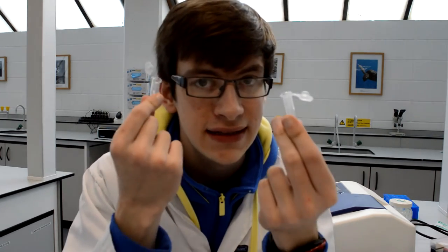And what I mean by balancing the centrifuge is that if you have something in one slot, you need to have something in the exact mirror of that slot with some sort of weight in it. So the easiest way to do that is take the number that you've put your Eppendorf tube in, half the total number of spaces, and add that to your original one, and you'll be able to put it directly opposite. If you have 24 spaces in your centrifuge and you put something in space 1, 24 divided by 2 is 12, 1 plus 12 equals 13. If you put one in a number higher than 12, then just do minus instead.